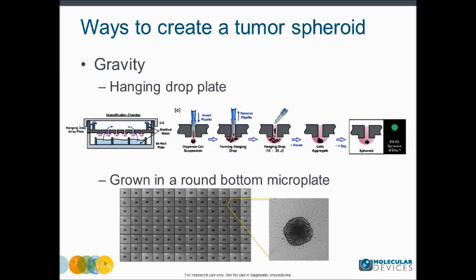The results Oksana will show in this webinar were achieved with this last method, where cells are cultured in low adherence round bottom wells. In this montage of transmitted light images, you see excellent reproducibility in the 2-day-old spheroids growing in a 96-well round bottom plate.